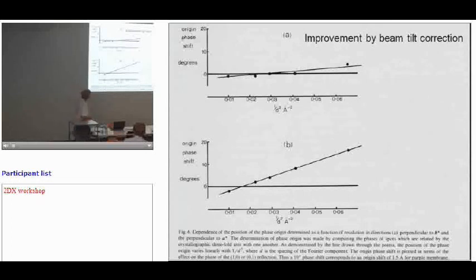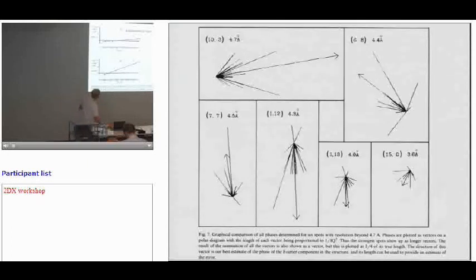But when this work was done, of course, that wasn't easy to do. And actually, we were working with Fritz, and he didn't tell us about this. What happened is a paper in 1983, David Smith et al., entitled "The Importance of Beam Tilt Correction in High-Resolution Electron Microscopes," and it refers to the Zemlin paper. So there are these 2 papers, '78 and '83, and then we included it in our software as a sort of automatic correction.